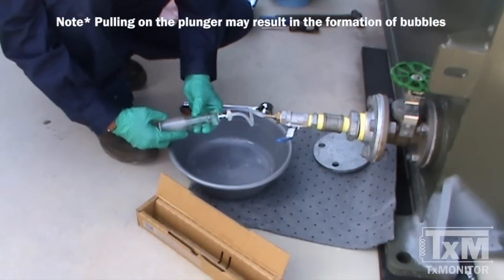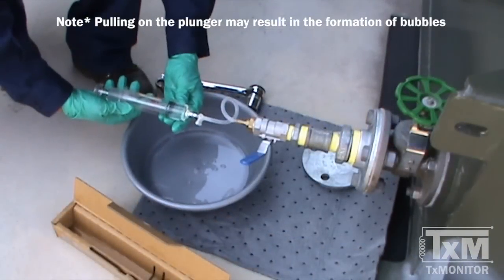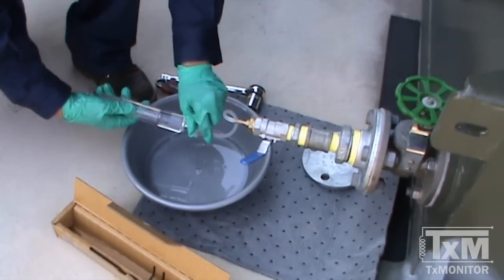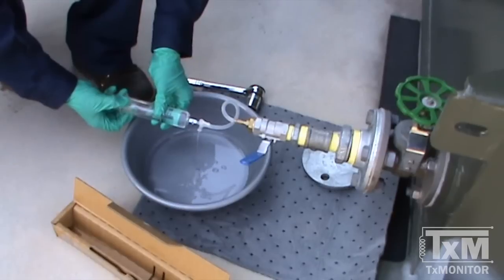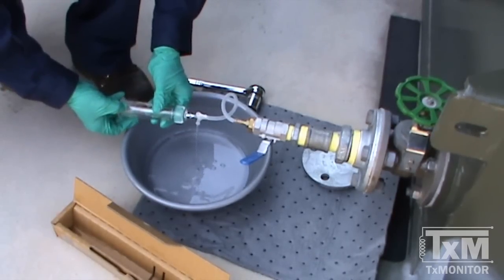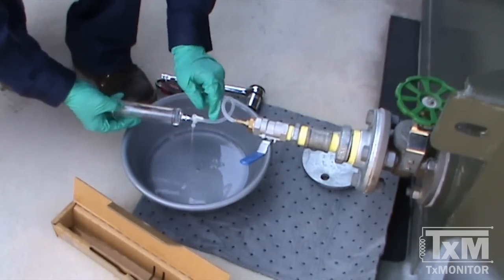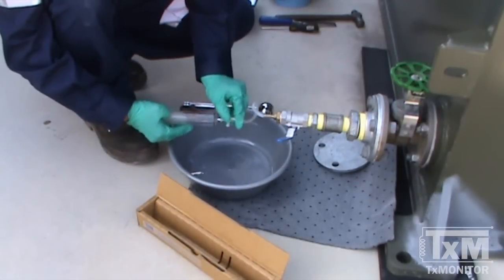Please note that manually pulling back the plunger may cause bubbles. Open the stopcock flushing port to position three and depress the plunger to evacuate the oil into the waste container. Flush the syringe a second time in this manner.